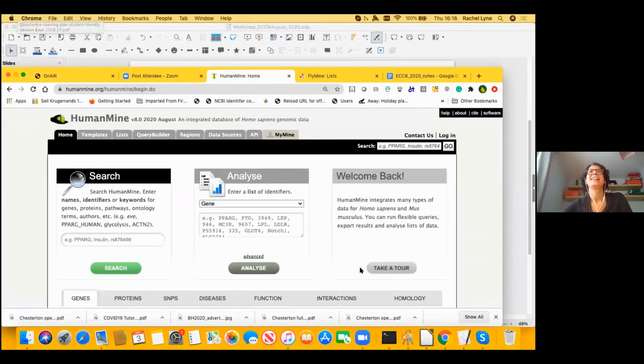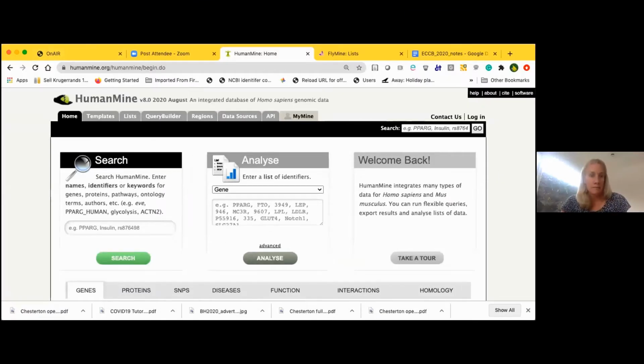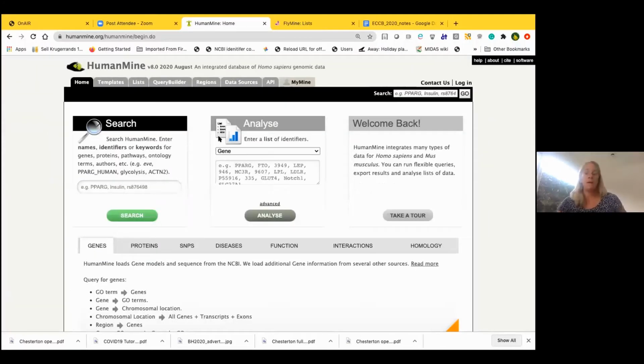Hold on one sec. Let me do the share again. New share. HumanMine. Found it. There we go. Okay, so hopefully now you can all see the HumanMine homepage.